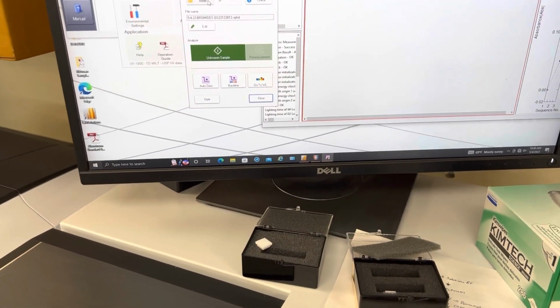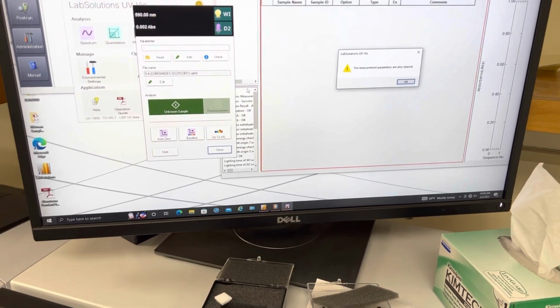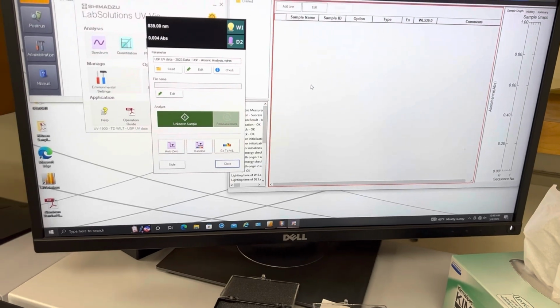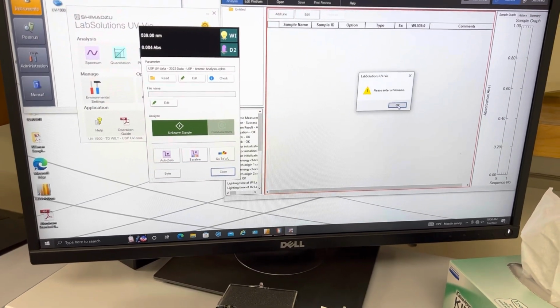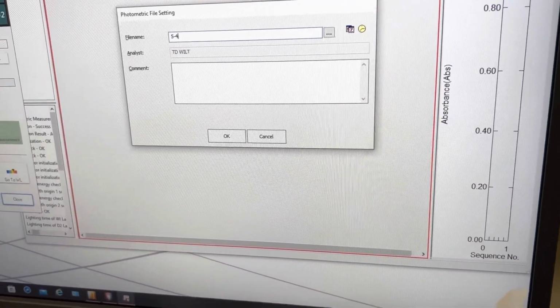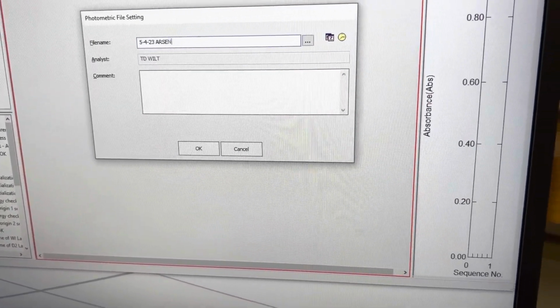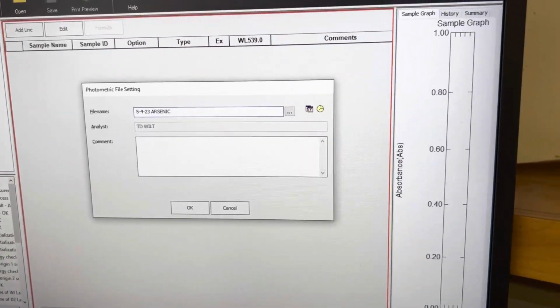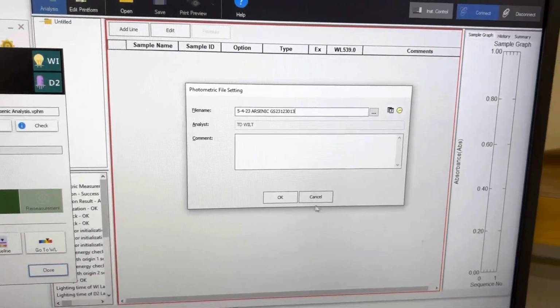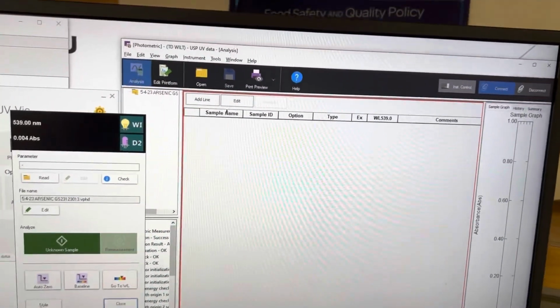Alright, so I'm going to click the read, set up a new test, arsenic. Bam, open. Clear that. R2 makes a noise. Add. It's going to want your file name, so here we go again. Arsenic. And the GS code. Done. Click. Now I can add my lines.